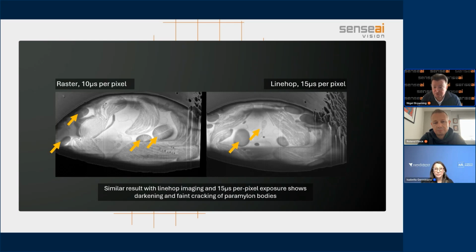And so the simple calculation is just the number of pixels you take versus the number of pixels you would have to start with. But in terms of the overall damage or charging effects on the sample, it's a little bit more complicated to do that. And that's why we have within the software a way to do a live imaging technique so that you can balance all of these things together to create the best images that you're acquiring while you're sitting on the microscope. That's a key part of being able to get live images. It means you can balance everything with the microscope when you're on the microscope doing the live images, so you can get it right. Then you take your section and then you move on.